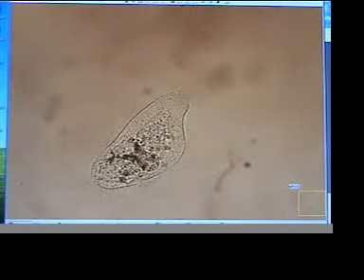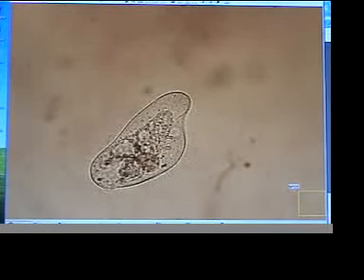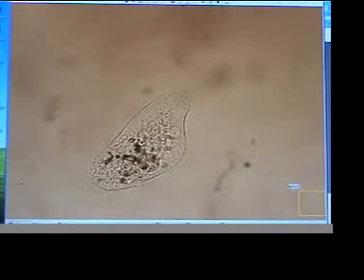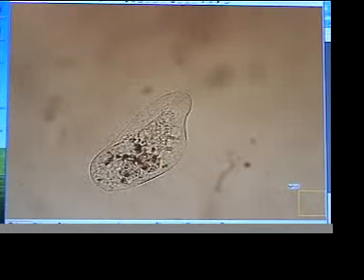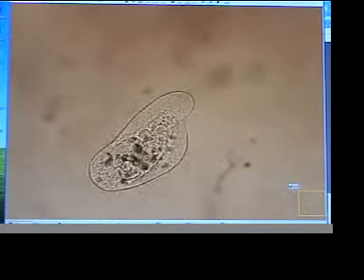These changes seem to have begun within 2 minutes of arriving at these particular frequencies. And it's possible that he is done changing right now. I don't see any cilia action in the scope. No movement of any kind. I would say this paramecium has been devitalized.